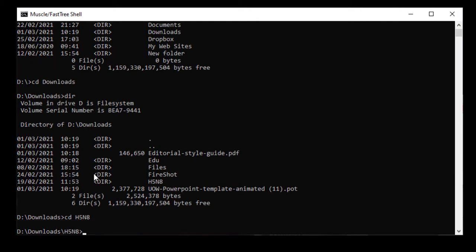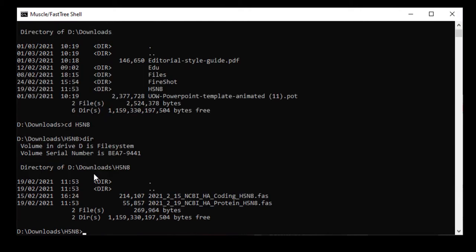When I use DIR to list the files and folders in that directory, I find that there's two files, a DNA coding file, which is 2021_2_15_ncbi_ha_coding_h5n8.fas, and a protein sequence file, which is 2021_2_19_ncbi_ha_protein_h5n8.fas.